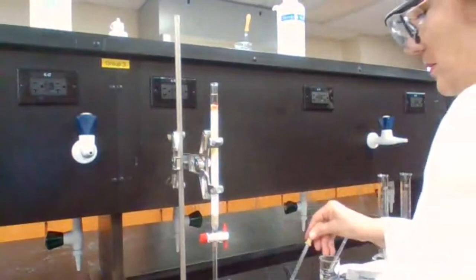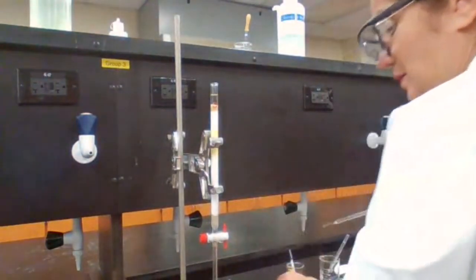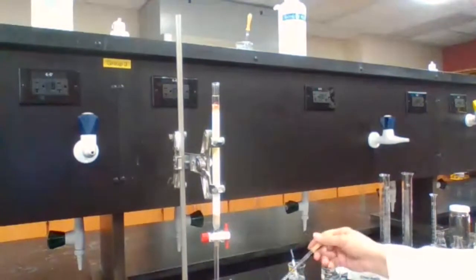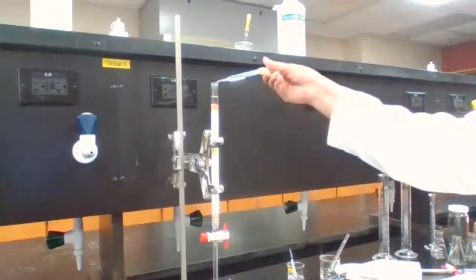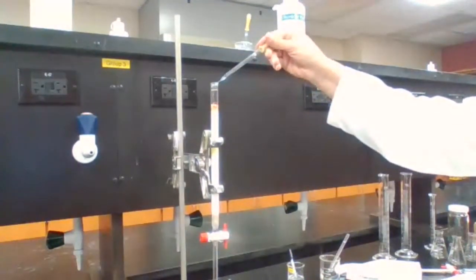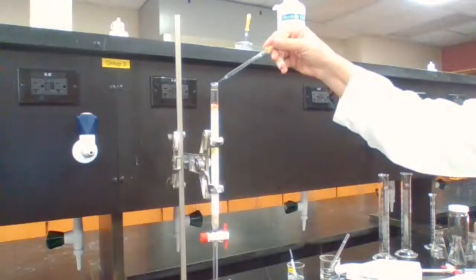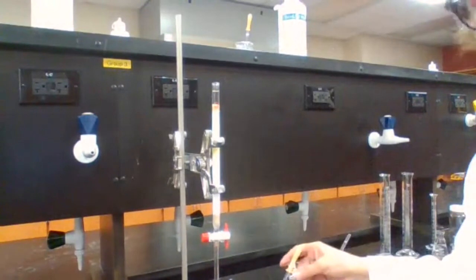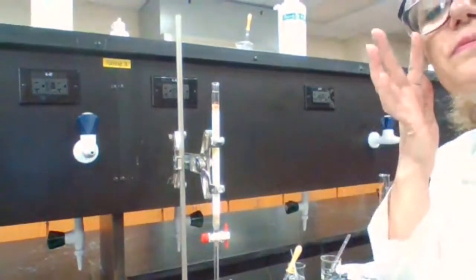I'm going from 9:1 to pure acetone, but it's not time for fraction 2 yet. When should I collect the fraction 2? Can you tell me?